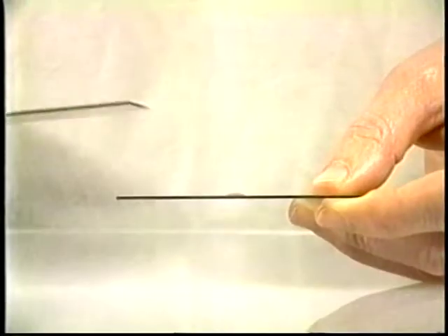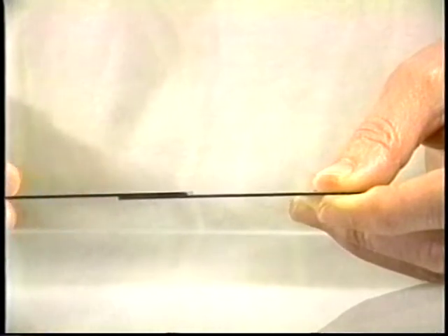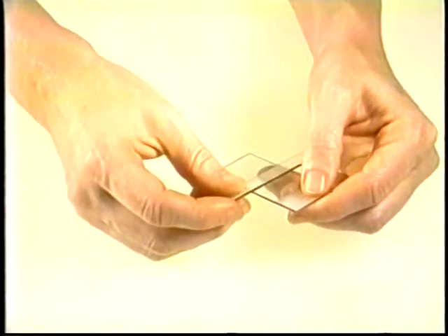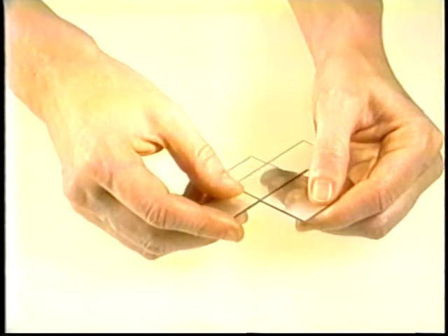There are other techniques for smearing semi-solid harvests. One is to simply place a slide on top of the harvest, press lightly, and lift apart. Another possibility is to place 2 slides together parallel and pull apart. Both these techniques may initially be easier to apply, but the first technique is going to produce a more even smear and less artifact, increasing the chances for a correct diagnosis.